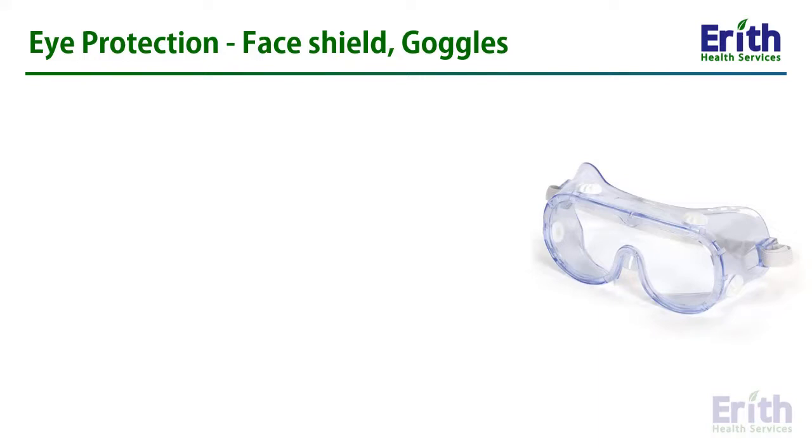Face shields, goggles, or eye protection. It's worn whenever there is a likelihood of splashes, spray, splatter, or droplets of blood.